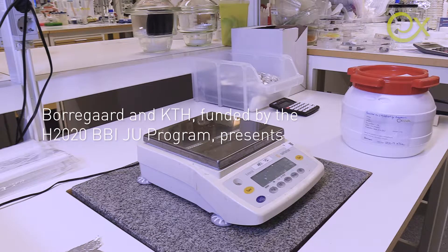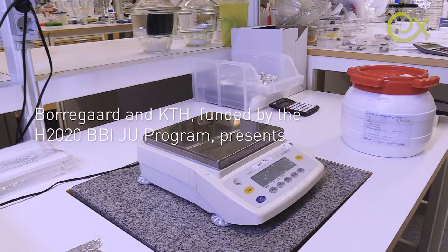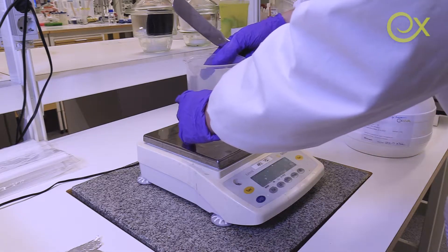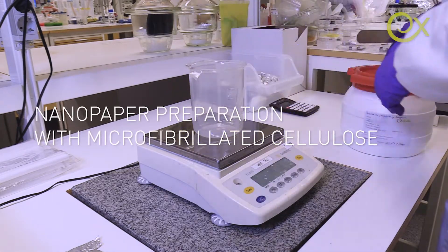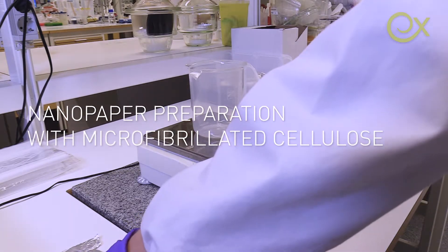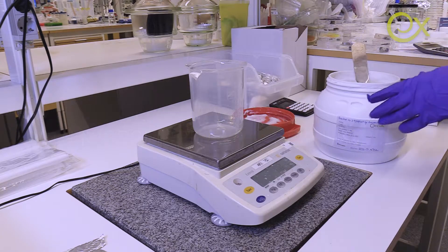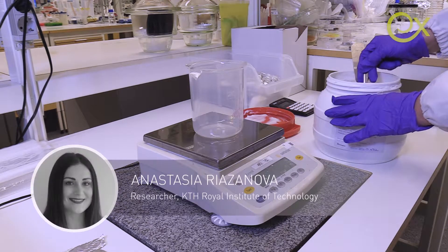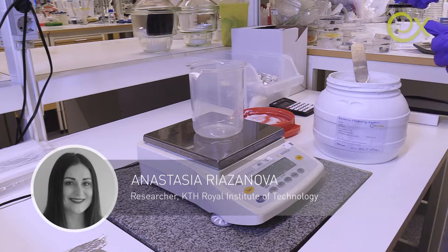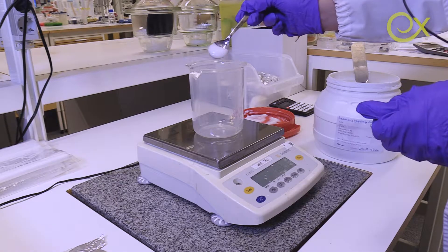Today we are going to prepare the nanopaper or MFC paper using the Exilva microfibrillated cellulose. We are going to use a concentration of 0.05 weight percent, and for that purpose I'm going to use only 9.8 grams of Exilva.